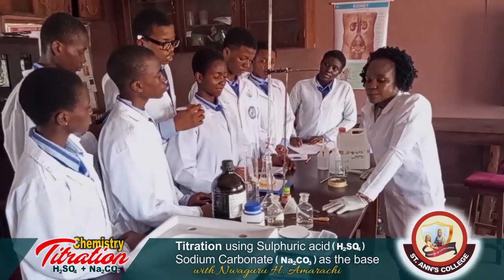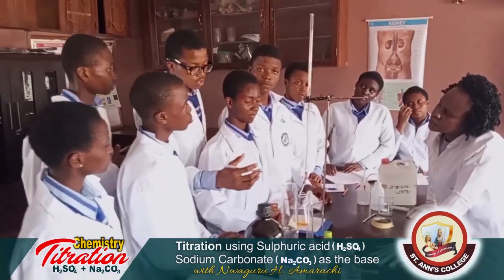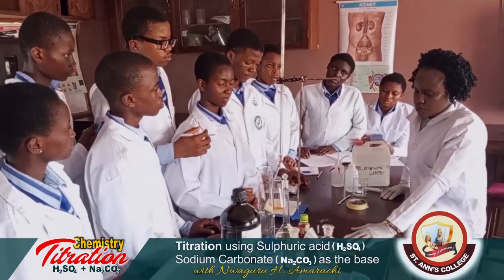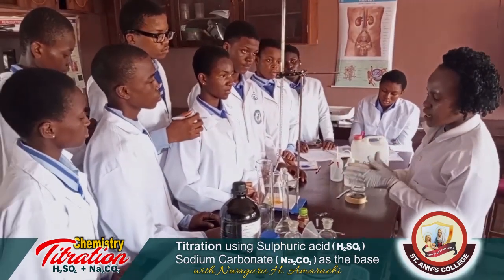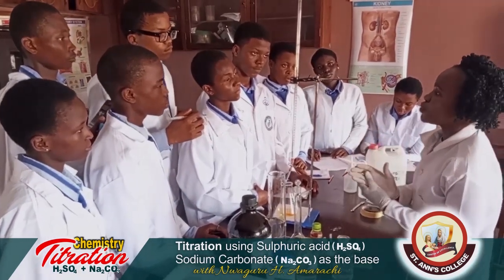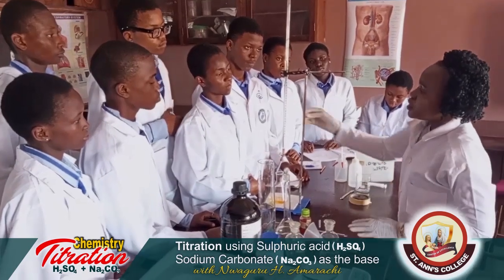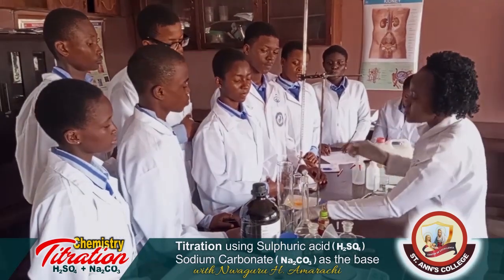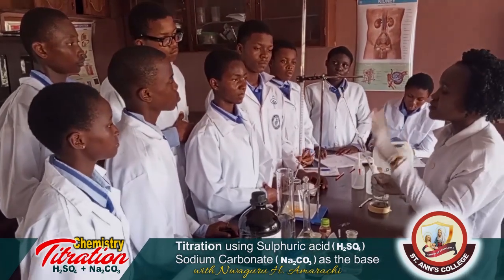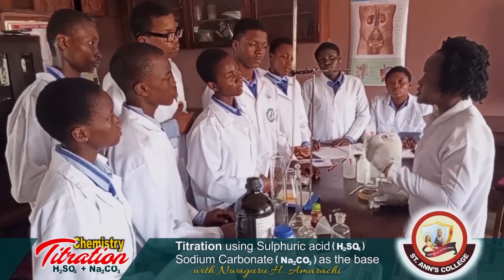Please, madam, is there any substitute to some of these apparatus we use here today in this titration practice? Good. If you must use any substitute, it must be an accurate measure of what is given to you. Now, you must use your burettes, and they are all calibrated. They have their standard measurements. So these 2 must be the same.